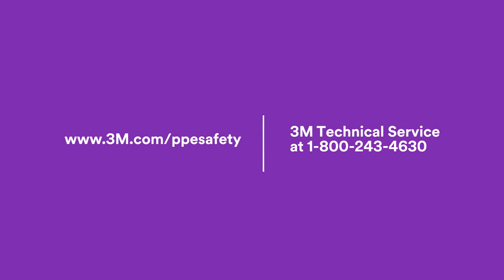For more information about respirator selection or use, please consult your user instructions, the 3M Personal Safety website, or call 3M Technical Service.